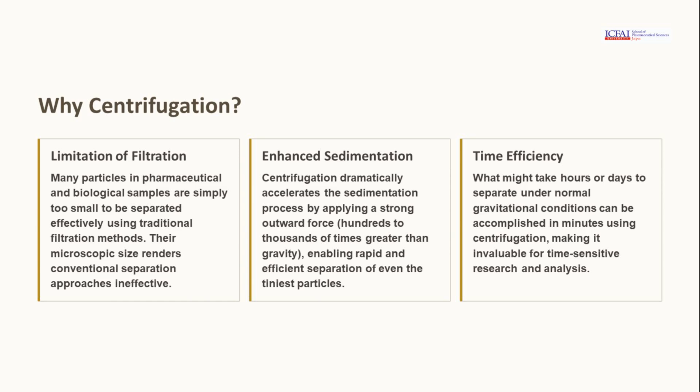Centrifugation offers significant advantages over traditional filtration methods. It overcomes the limitations of filtration by effectively separating microscopic particles. Enhanced sedimentation accelerates the process, making it invaluable for time-sensitive research and analysis, as it can achieve in minutes what might take hours or days under normal conditions.